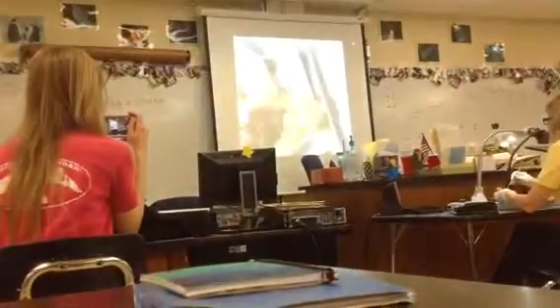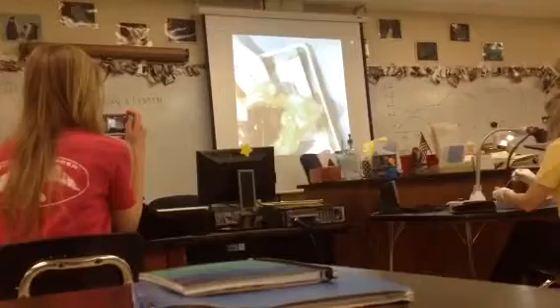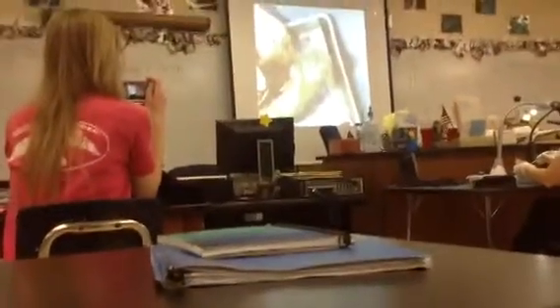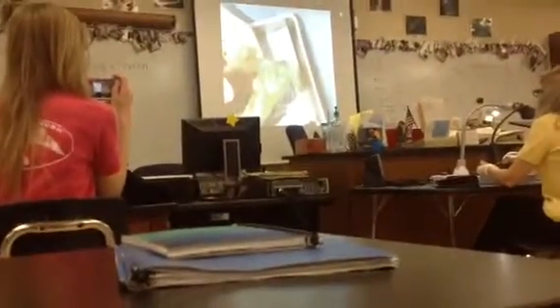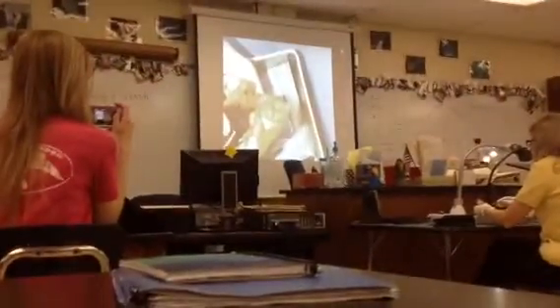There are flaps on the top of the heart. So this flap over here is going to be the right atrium. The flap over here is going to be the left atrium. Okay, then, coming off the top of the heart is this arch.